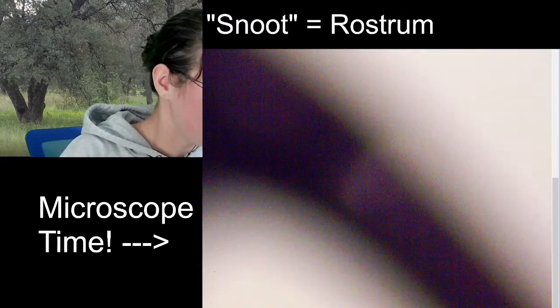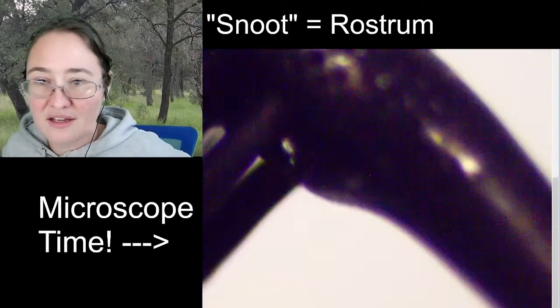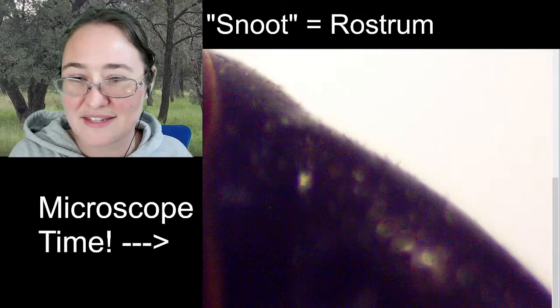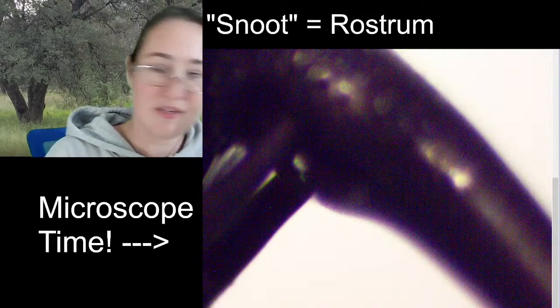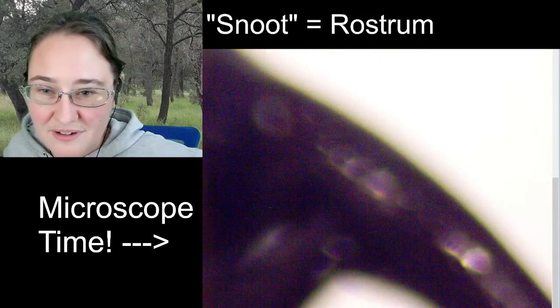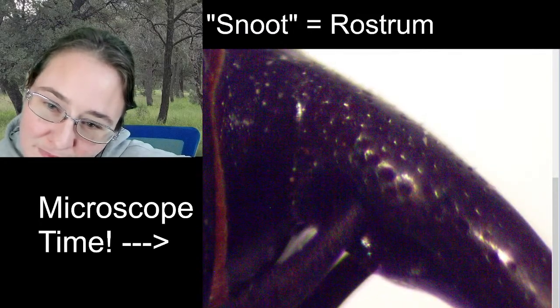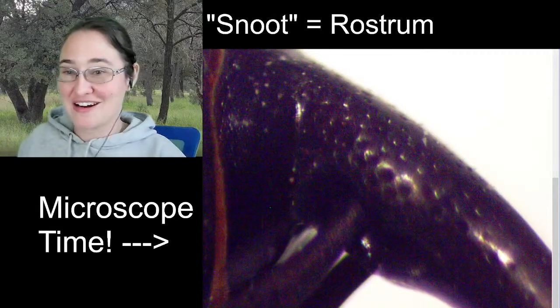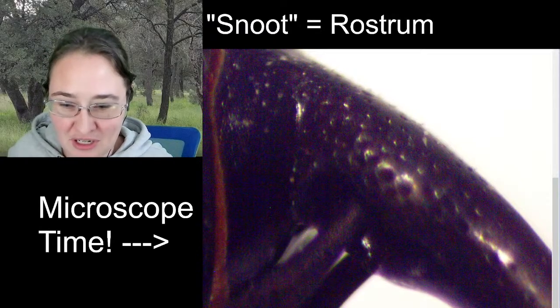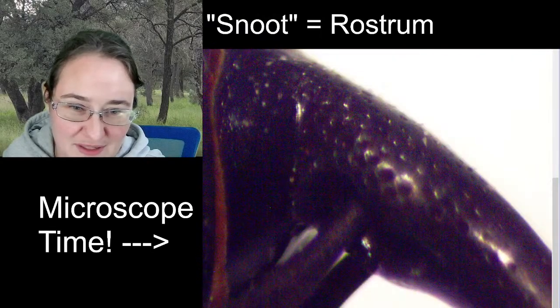And you can see the compound eyes. All right. Let's see. Well, we're going to zoom in to just the eyes and see if we can get them into view. So that's where they are. And they're a little bit tricky. The microscope seems to be a little bit dark on the computer, and I think that is, yeah, as bright as it's going to want to go.